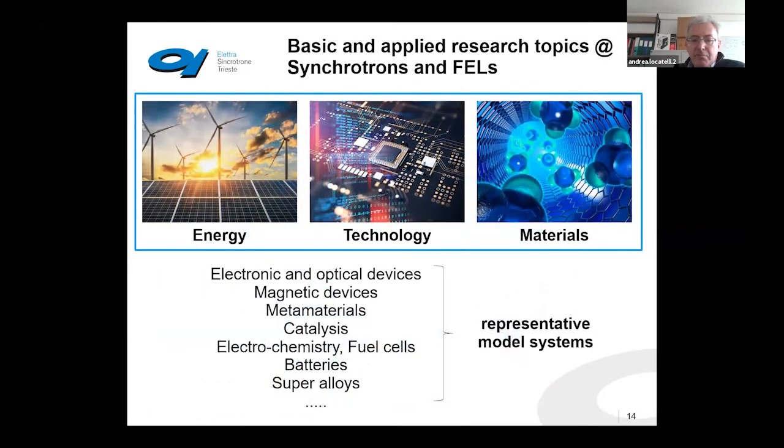These beamlines are mostly active in these areas: essentially material science, nanotechnology, and energy-related topics. Of course, we study these topics by focusing on what we call model systems.